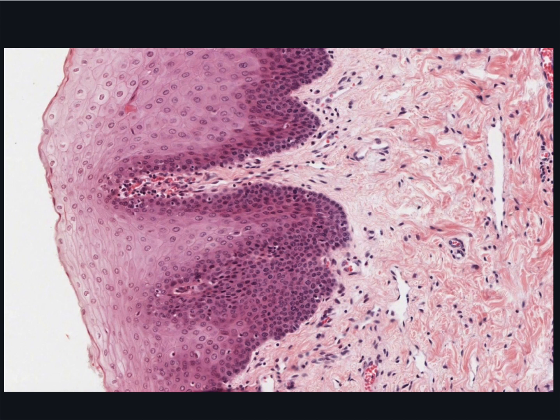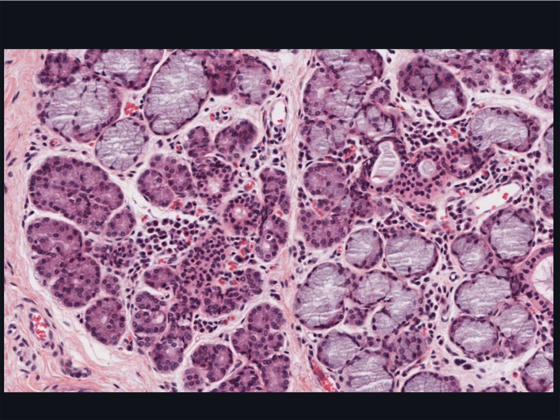The labial glands in the lamina propria, labial refers to the lip, are mixed serous and mucous. The serous cells are pyramidal, with a round nucleus in the basal part of the cell, where the cytoplasm stains darker due to stores of ribosomes. Their apical cytoplasm is pink in hematoxylin and eosin staining and contains zymogen granules, precursors of salivary amylase. The cell boundaries are rather indistinct.